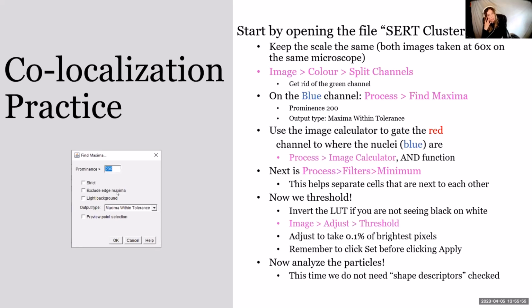The way we actually did it in the main macro is we have language that's a bit more complicated than what I wanted to teach here, but we have it where it calculates the histogram for every image individually and then takes 2% of that histogram. But in this case, when we have everything, 0.1 just works best for the example.